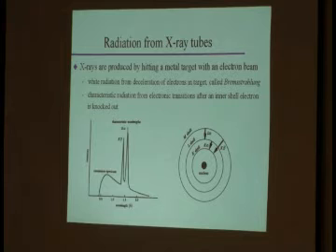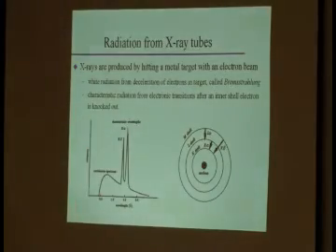So wouldn't alpha always be closer than the beta? The alpha is always closer, but sometimes it just so happens that one of these falls down. The K alpha line is usually the strongest line, so you're absolutely right about that. That is why most diffraction experiments are done with the K alpha line. If you look at the tables like the one that you were given on the exam, the K alpha is the strongest line. But the other ones also happen. There's a little bit of statistics involved there and all kinds of quantum probability. So all of these transitions do happen, but the K alpha is the strongest one.